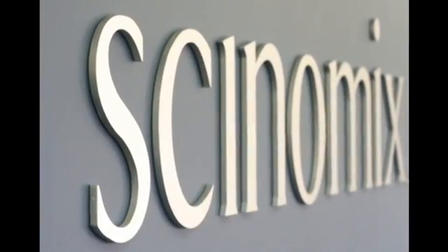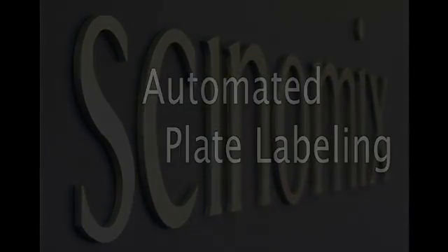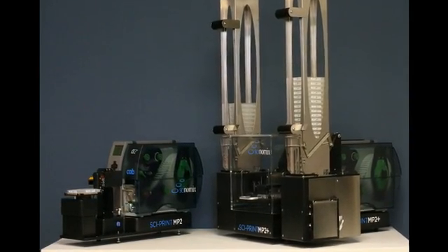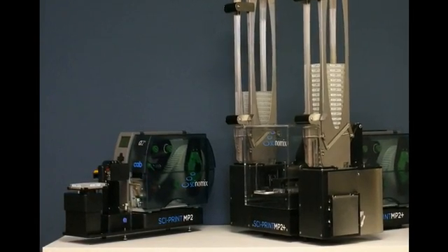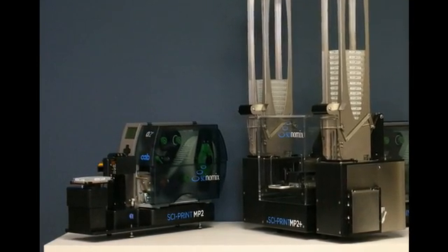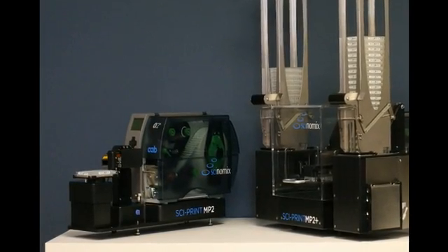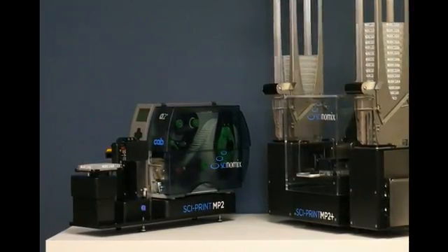Scinomix offers a range of automated plate labeling solutions to increase plate handling efficiency in the lab. The Scinomix MP2 Plus Labeling System is a high-throughput, fully automated barcode printer for labeling microplates and deep-well blocks. Scinomix also offers the Sci-Print MP2, which is a semi-automated plate labeler that can be used as a standalone device or integrated into larger automated systems.